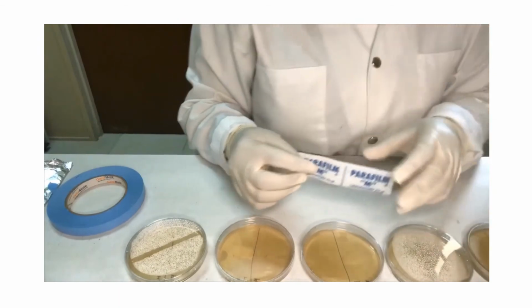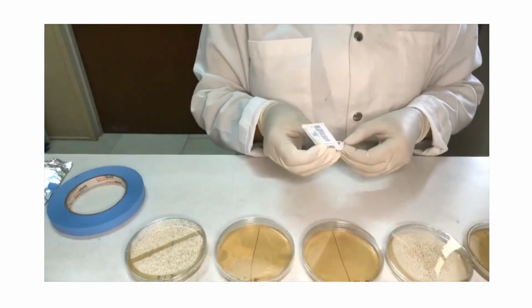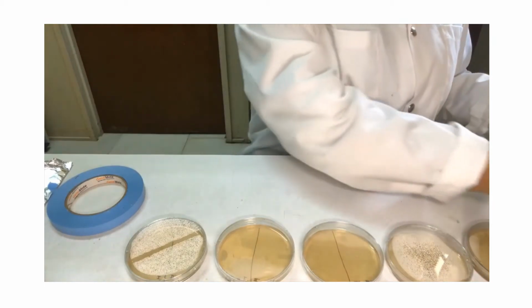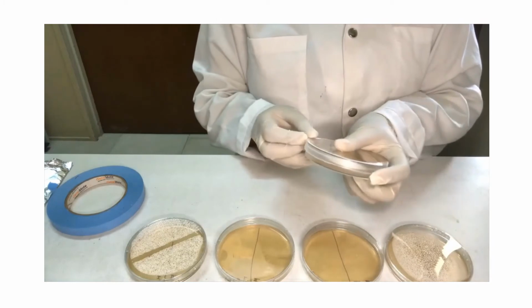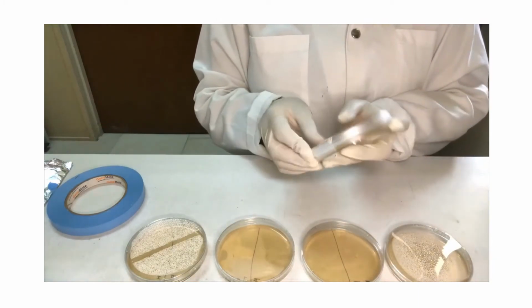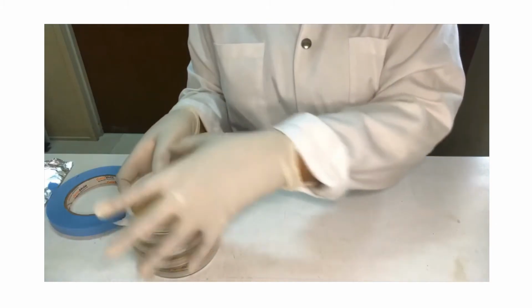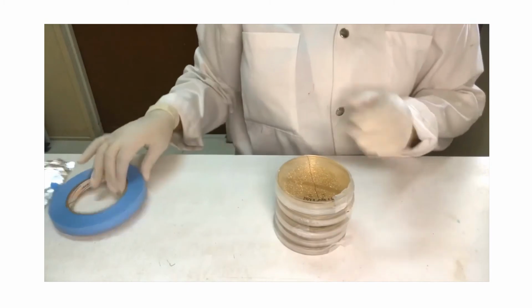Now that the process of inoculation has finished, it's time to seal the plates. Parafilm is used to seal the edges of the plates. The plates are then stacked, inverted, taped together, and labeled appropriately.